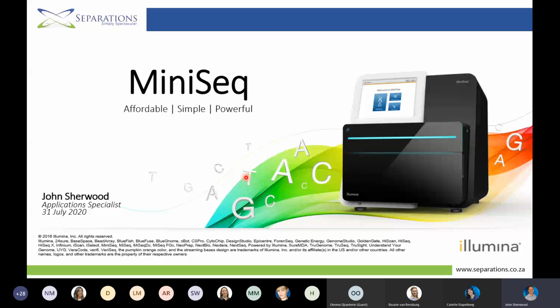So this session will basically focus on the next benchtop sequencer, from the range of benchtop sequencers by Illumina. It's known as the MiniSeq. What we're going to do today is look at what the MiniSeq is, what its applications are, and where it fits into the next-gen sequencing market of Illumina.